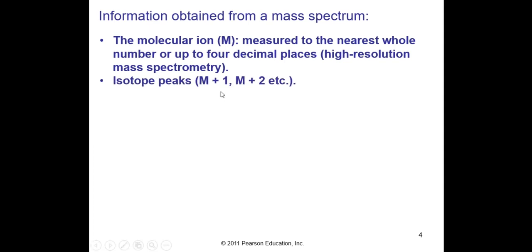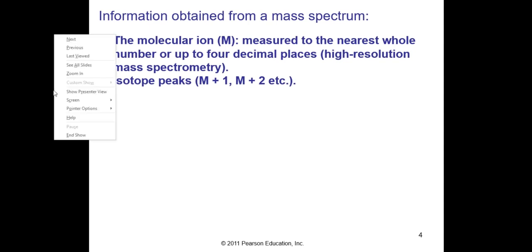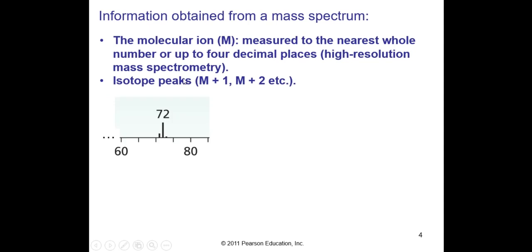Isotopic peaks, M+1, M+2 can be detected when you have a deuterium or a C13. As the molecular weight increases, you have a greater chance of seeing deuterium and carbon-13, and you will start to see M+1, M+2 to a greater extent.